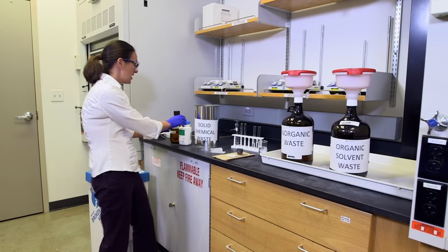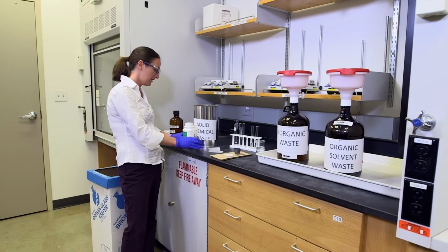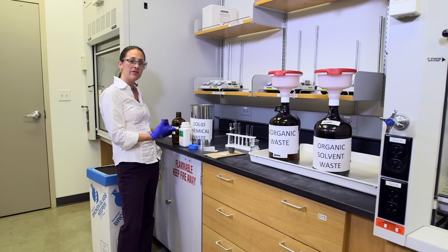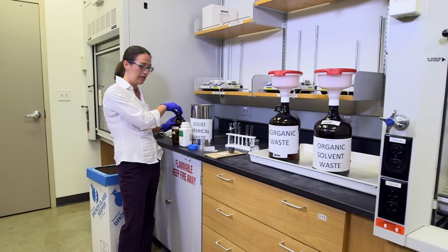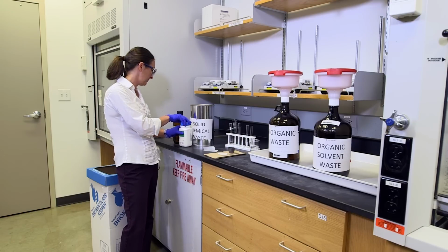Another thing, before you're done with your experiment, and I alluded to it a couple times, is we don't leave bottles and containers open in the lab. You don't know how volatile these things are and what kind of effect they can have on you. So it's important to always cap immediately after getting out your sample or pouring out your sample.